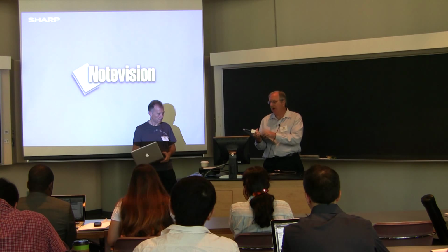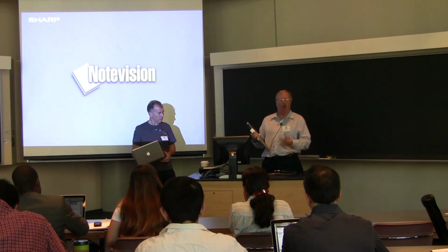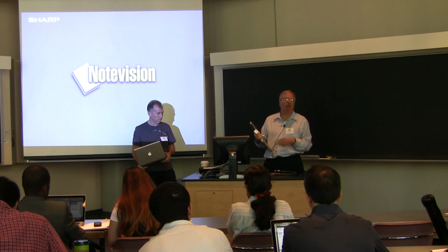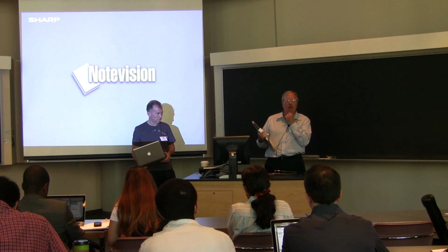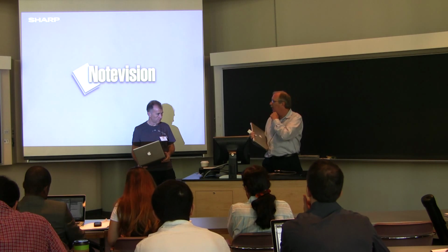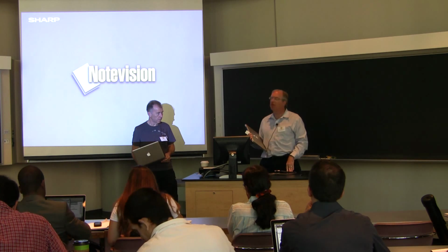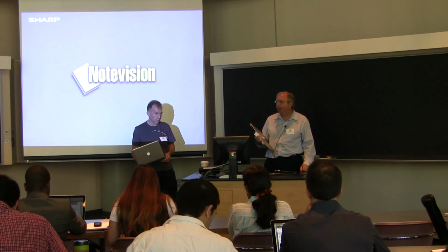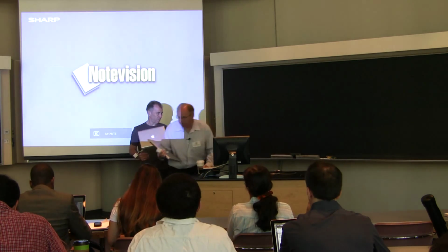We're in the process now of trying to generate outputs that can be uploaded into FlowJo so that you can use that as a starting point and maybe do some refinements in FlowJo or use their visualization tools. But I know Tim's group uses FlowJo very intimately in their analysis, but we're working on that right now. Thanks, Tim.